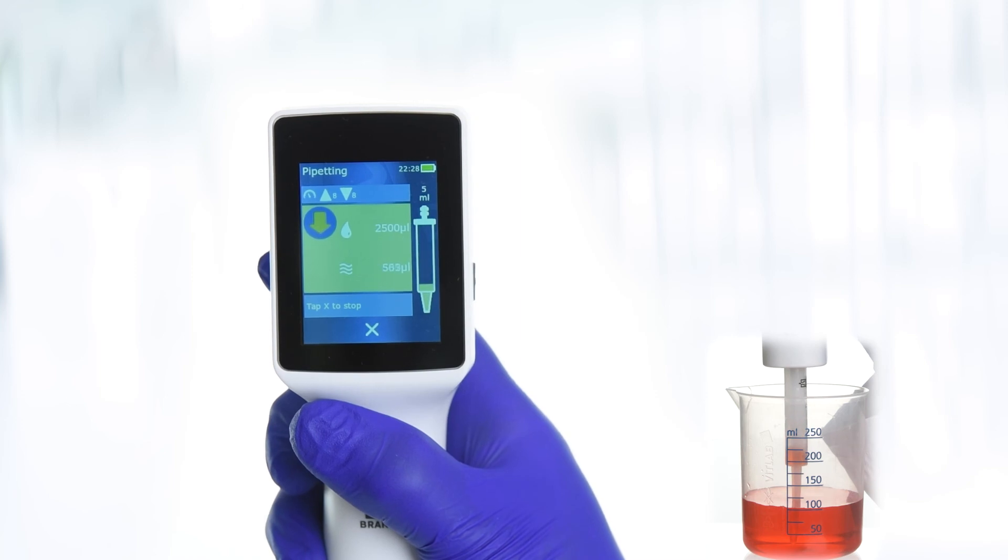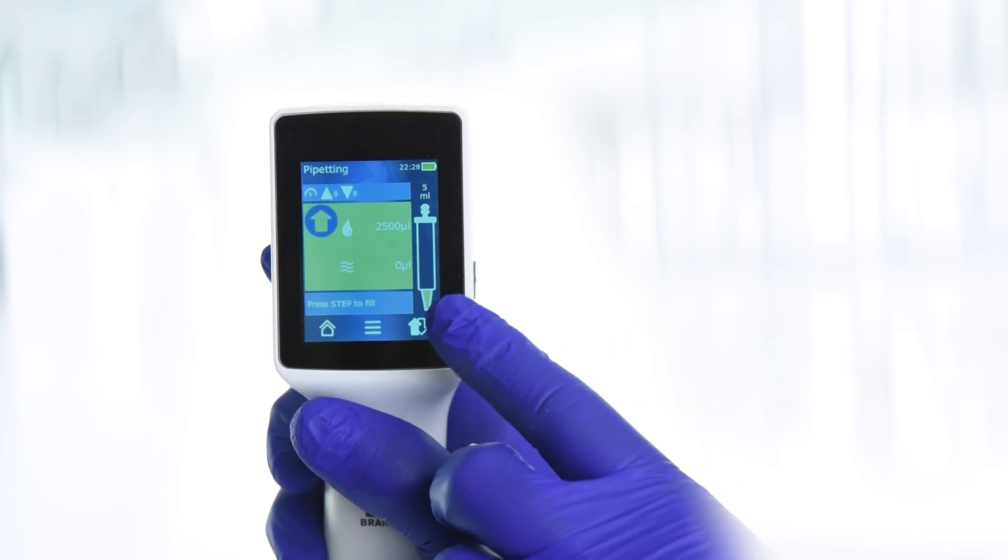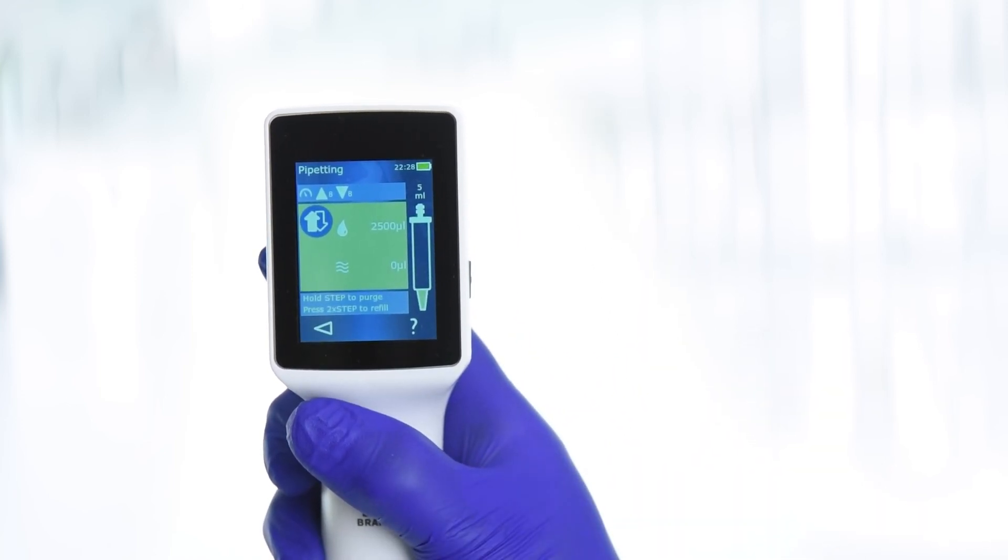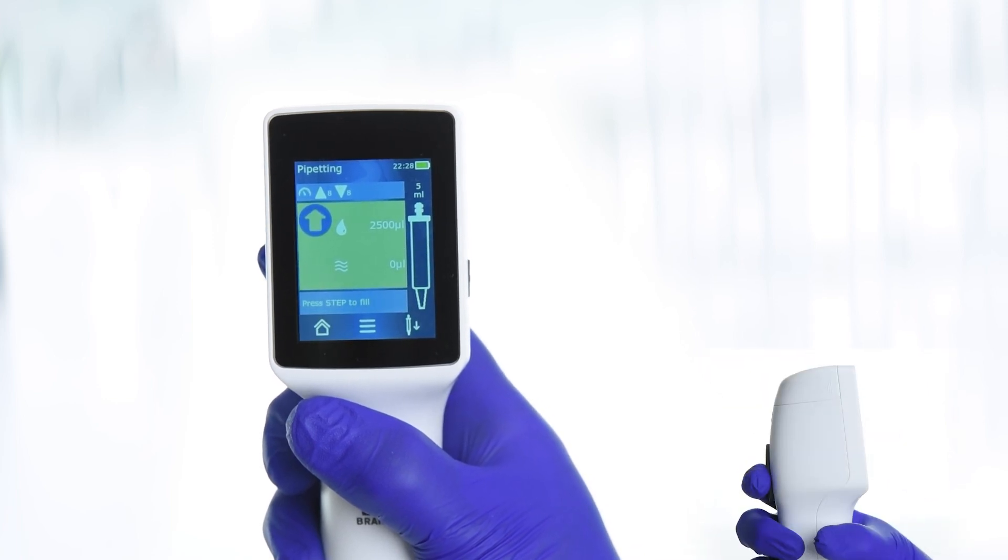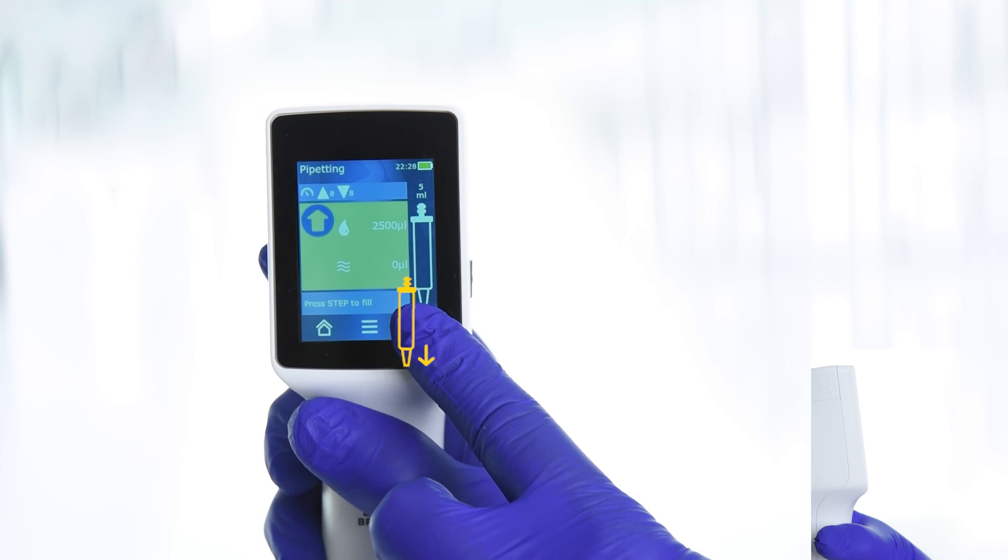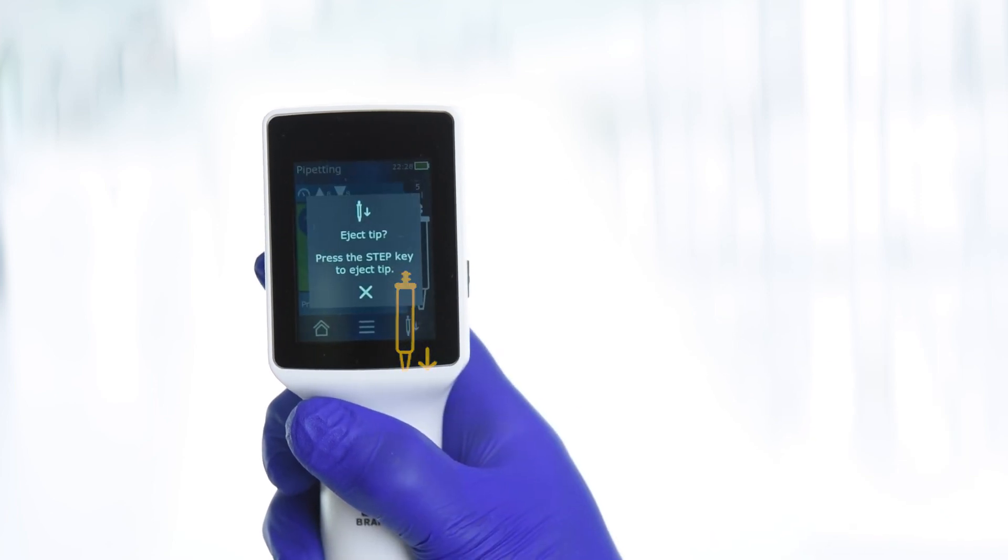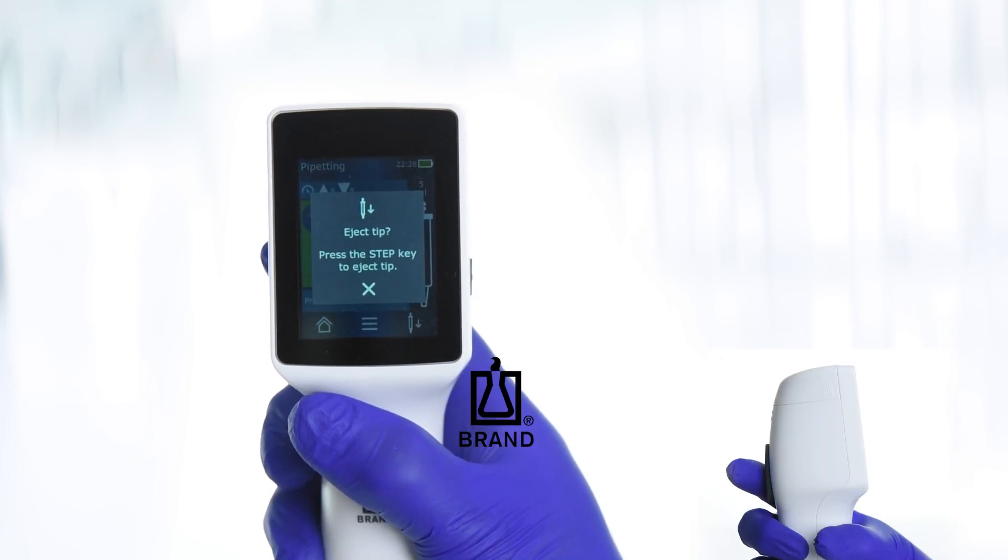To purge or empty the PDTip, first tap the up and down arrows in the bottom right corner of the menu. Next, press and hold the Step key to purge the remaining liquid in the PDTip. Tap the tip ejection icon and press the Step key to eject the tip.